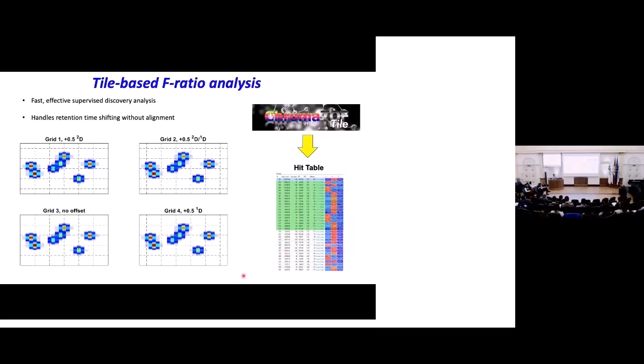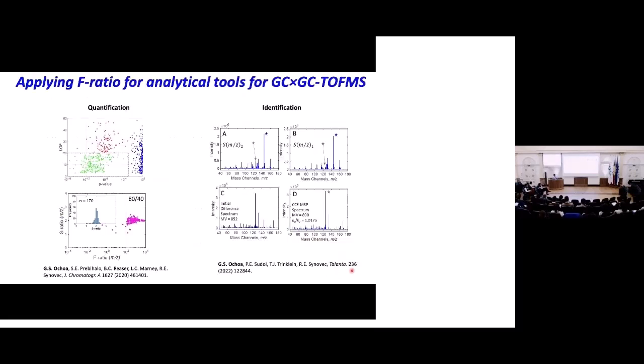And so in our group, we tried to go beyond just finding out what the differences between compounds are. We're trying to do a bit more statistics on the information we get off of F ratio to make better chemometric tools that we've gone through using quantification and identification.